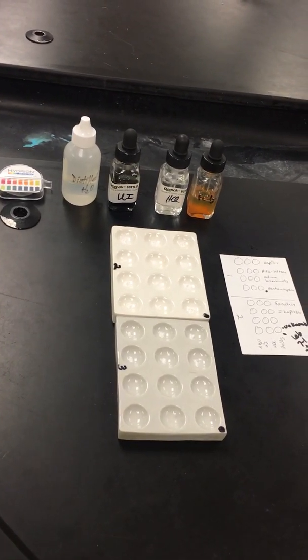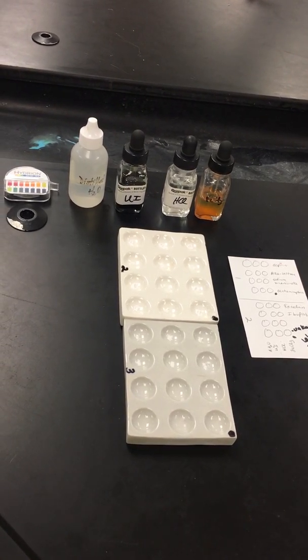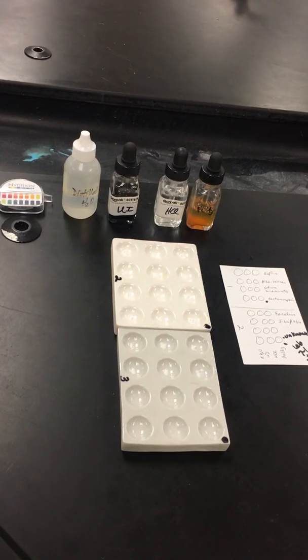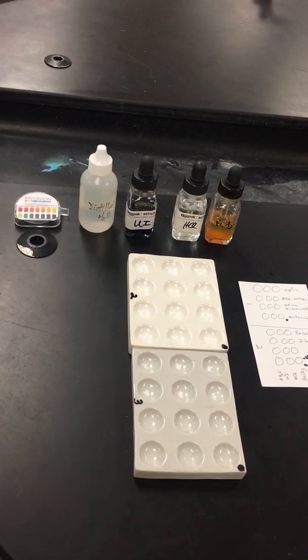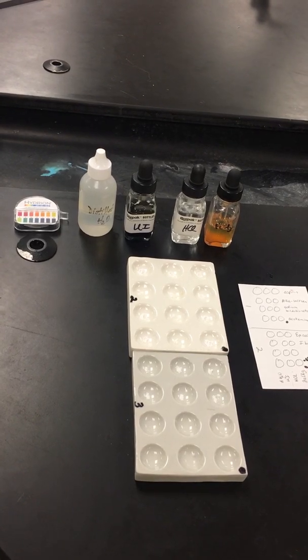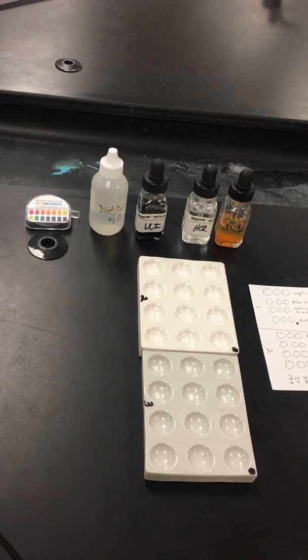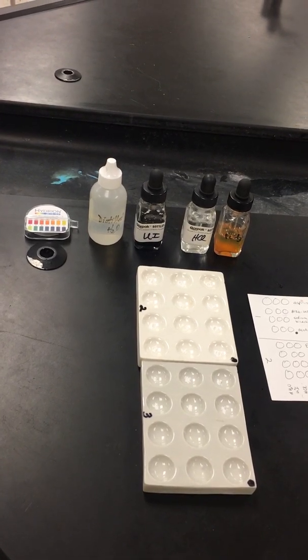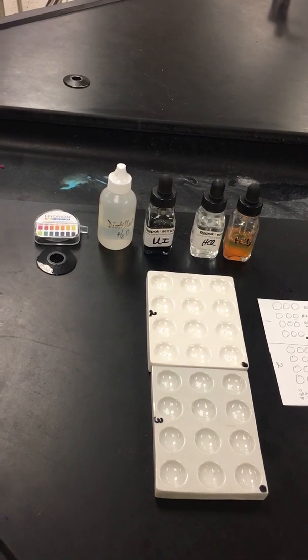The story is that at the international arrivals area of the Detroit airport, a random inspection of a passenger suitcase reveals a film canister containing a white powder. The passenger indignantly says it is ibuprofen powdered for quick dissolving as a headache remedy, and that he never travels without it. So the customs agents need to have a quick spot test done because they don't know whether to call the DEA or just let the man go.